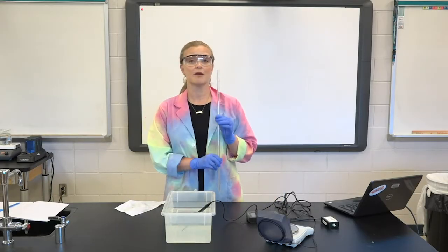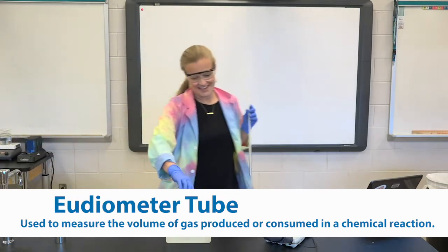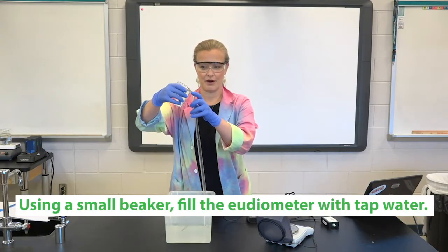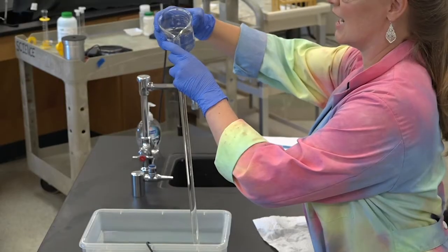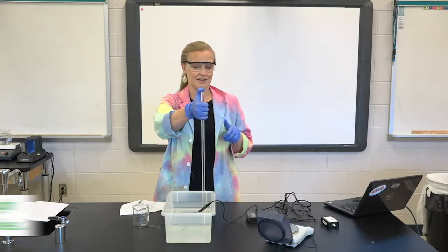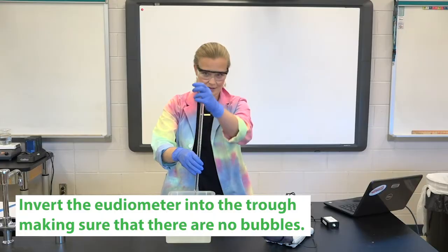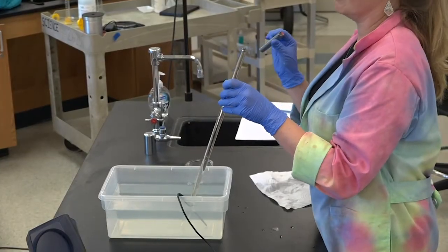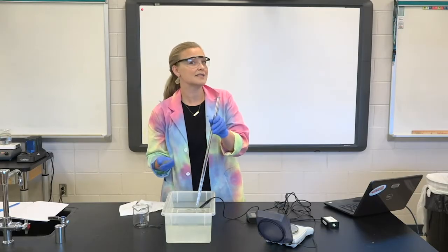We also are going to need to fill up our eudiometer tube with tap water — fill it up all the way, not just to the 50 milliliter mark, maybe even spilling over a little at the top. We want it to be completely full of water. The idea is like when you were a kid playing with a straw, putting your thumb on and off. I'm going to put my thumb on this, invert it, and put it in the tub of water. Now that my thumb is off, the tube stays full of water. When I start to release butane, we'll see a distinct line between where the liquid water ends and the gaseous butane begins, and that's how we get a really good volume reading.